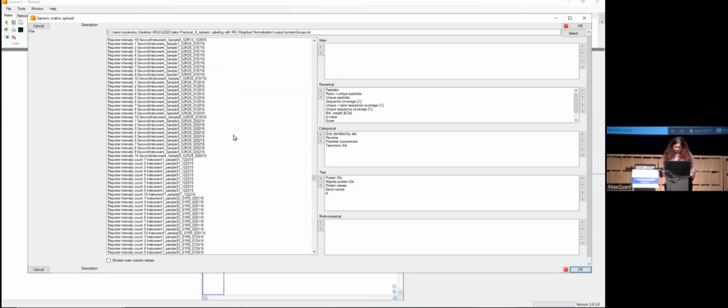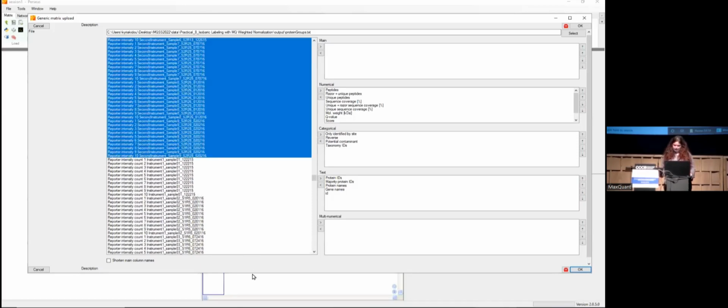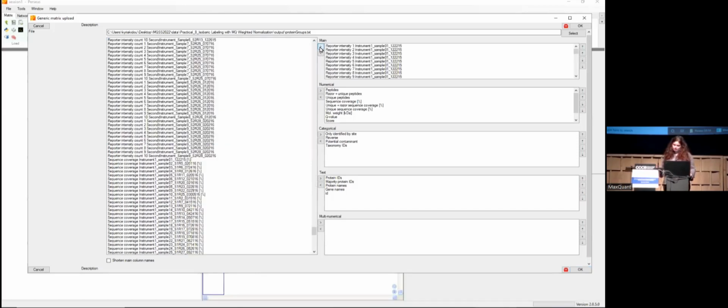I select all of them. There it is. And here, with main, I include them in the right panel. When I've done, I press OK.